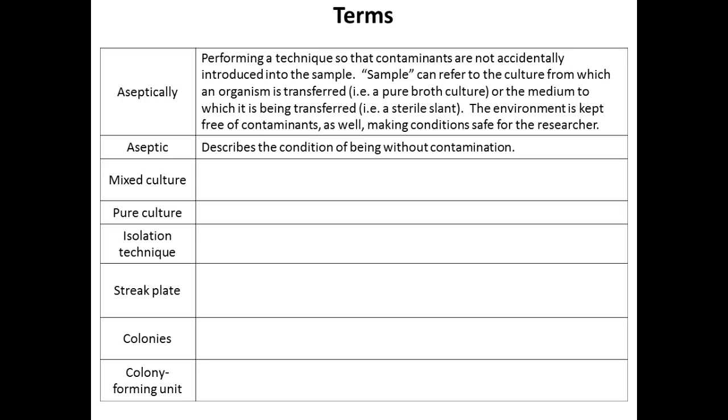So this is Lysol, right? We have 2 spray containers that I bought with my own money, because I get tired of us pouring it. I wanted to be able to spray it. We'll use it to disinfect our countertops, our desktops before we start and when we get done. And definitely if we have a spill, we're going to disinfect, right?